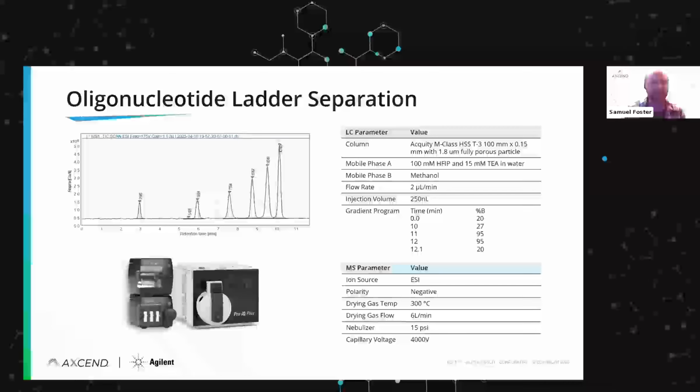Now, on top of that, there are a lot of other benefits. So one of the things that we've been trying to cut down on as analytical chemists is the use of PFAS. PFAS is in everything. It's not great for us. And so there's all sorts of regulations, fears, and guidelines around how to get rid of it. And that's great. And I think we should. The problem is it's really good sometimes for analytical analysis. And specifically, if you're looking at oligonucleotides, HFIP or hexafluoroisopropanol is a very powerful additive commonly used in these mobile phases as an ion pairing agent that not only increases your resolution, but it also increases your ionization efficiency of oligonucleotides. And so if we don't want to get rid of it, or we can't get rid of it, we should at least be trying to use less of it.